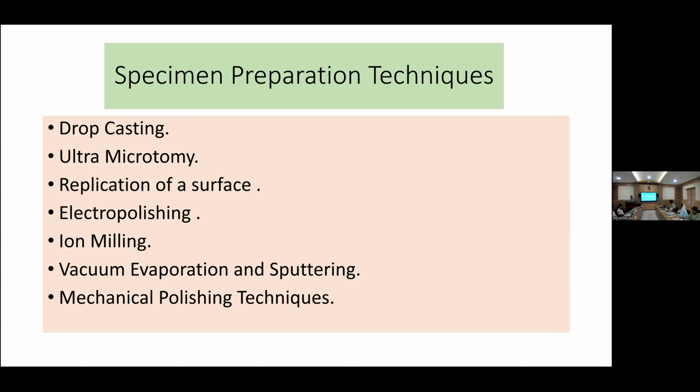To avoid that, we make it conductive. But in TEM, there is no need for a conducting sample. But the thing is that we should have an electron transparent sample. We should prepare the sample very thin, that is below 100 nanometer size. That is the preparation criteria.